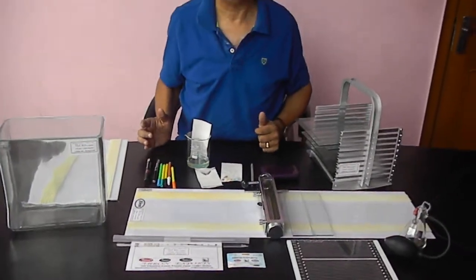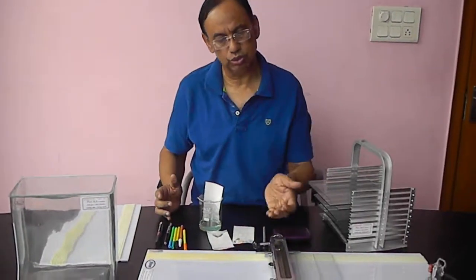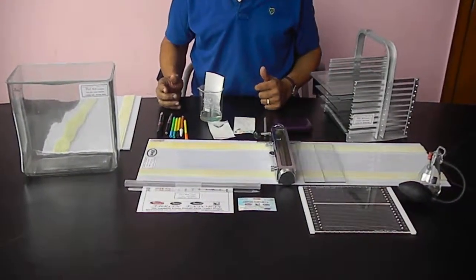This is the kit, very cumbersome. The ready-made plates are also available by some very costly Whatman and TLC. Other plates are also there. You can use the same also, but you can do your coating also. Very easy setup by us.